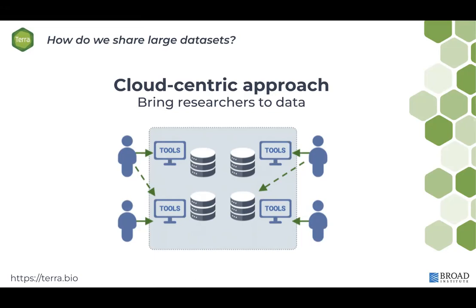You're not paying for compute power when you're not using it. You're not paying for a giant computational infrastructure to just sit there for the months in between when you're not using it. You're building virtual machines that scale to meet your needs. Not having to make those big infrastructure investments to do research makes it more equitable as well.